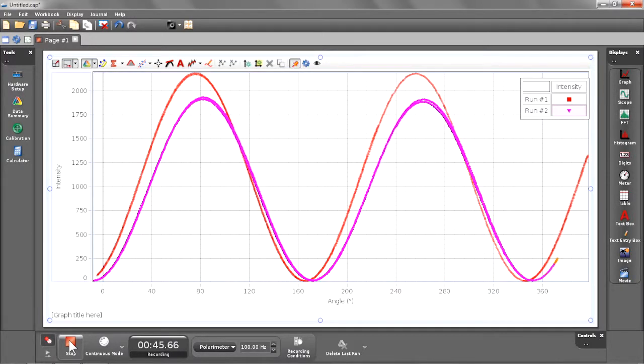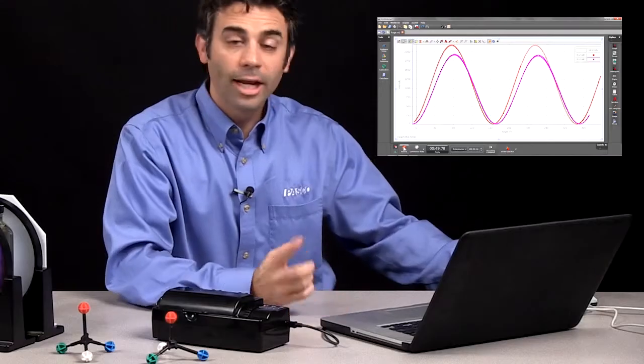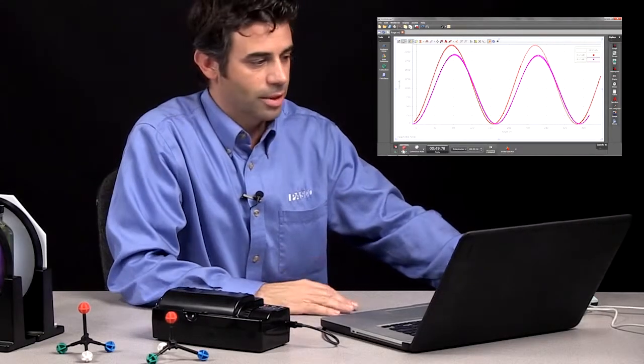You can also look at the graph to see that you're going from zero to 360. And once I get to 360 a couple of times around it out, I'm going to hit stop. And now I'm going to do some analysis. And this is where the software comes in.